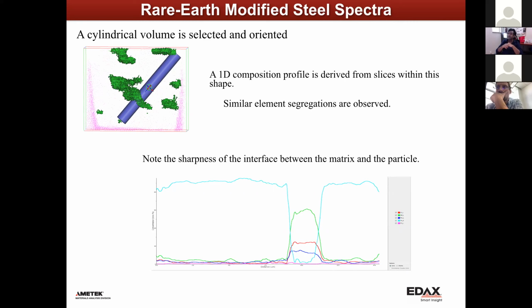So you see this, there is a cylinder being drawn, and the user is interested in analysis of the region that is encapsulated by the cylinder. Okay, and that bottom portion shows that analysis. So you don't have to worry about the rest of the region. You can select out a region of your own interest.